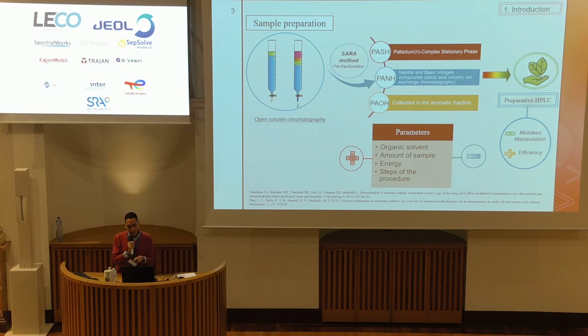So in this case, the HPLC in preparative mode appears, and this technique can provide a reduction in mistakes due to the reduction in manipulation, but also, most importantly, an increase in the efficiency of the fractionation compared to the results already reported for these samples applying the open column chromatography.